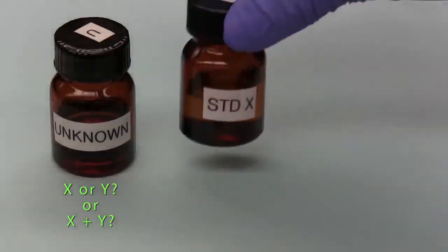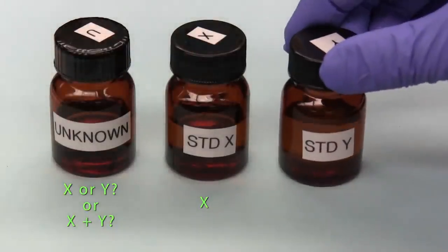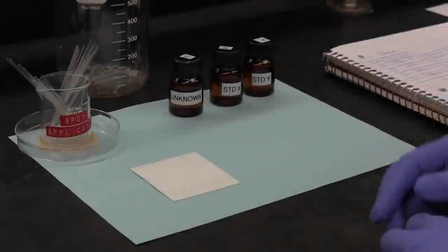In this bottle, we have an authentic sample of compound X, a sample which we know beyond any doubt is compound X, so we call it standard X. This is our first reference. In this bottle, we have an authentic sample of compound Y, a sample which we know beyond any doubt is compound Y, so we call it standard Y, and this is our second reference.